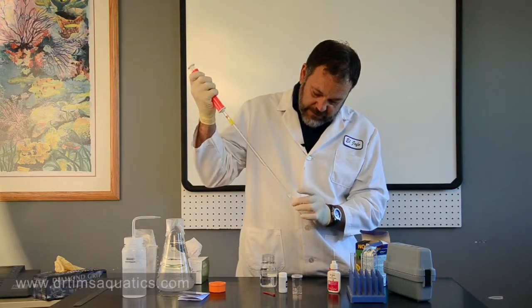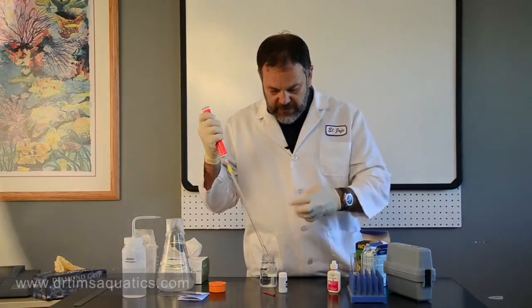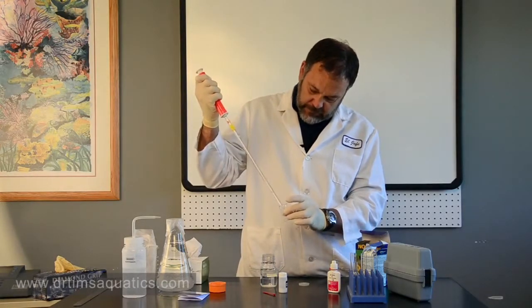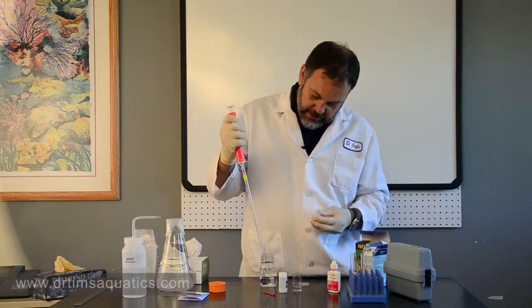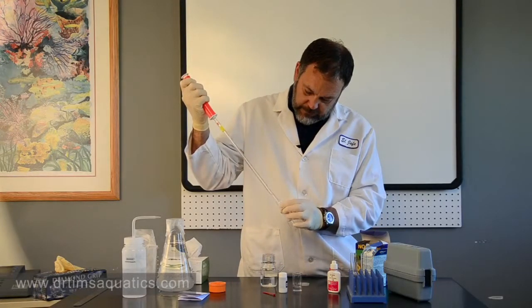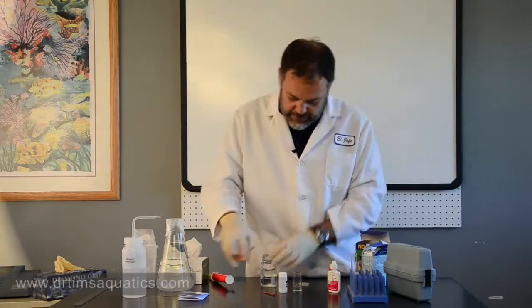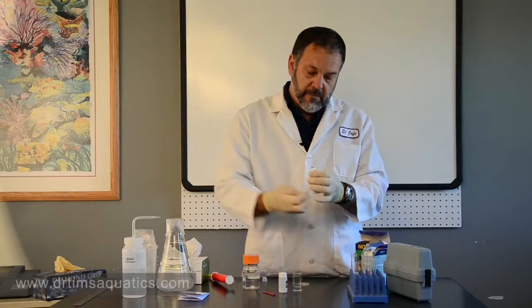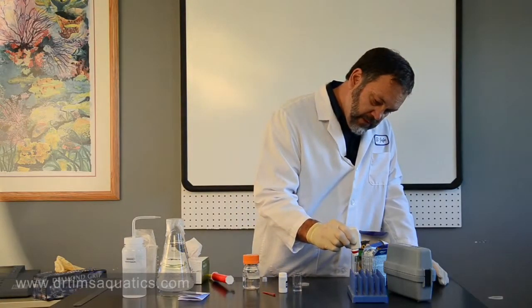Measure out five mils. Same with the Salifert kit. Then the HAWC. For the Aquarium Farm kit, invert the bottle straight up. For the HAWC, add five drops: one, two, three, four, five.